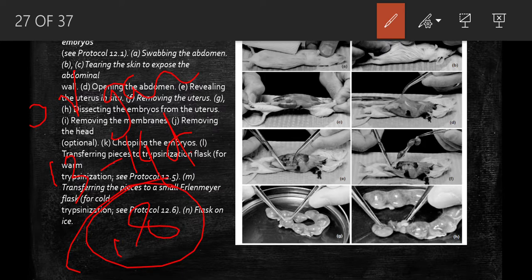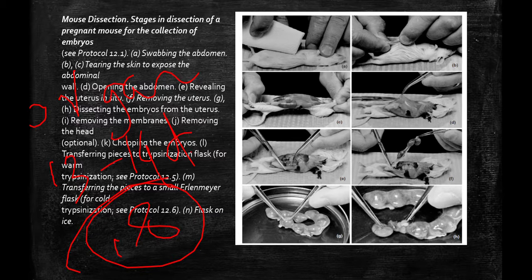Now we're going to sacrifice or kill the mouse. You don't use the term kill, you say you're going to sacrifice the mouse for the experiment. Sacrificing the mouse is done by cervical dislocation for a fast kill without too much pain.